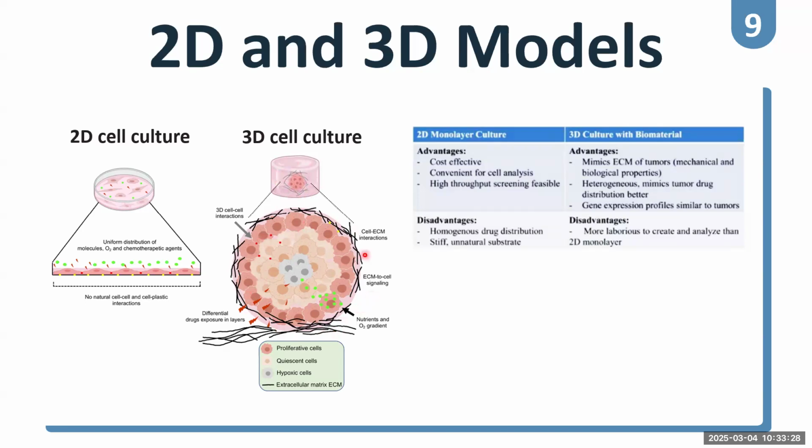structure. Also, the 3D structure is not only the cancer cell. Somehow we can put another molecule or another cell to join together to form the 3D and study the cell-to-cell interaction and also the cell-to-ECM interaction.